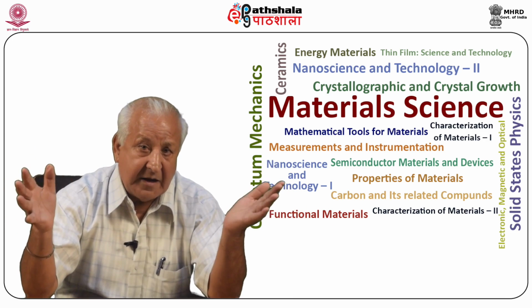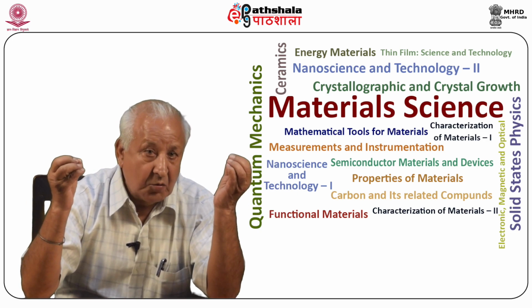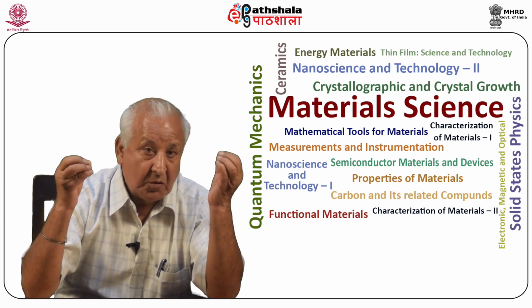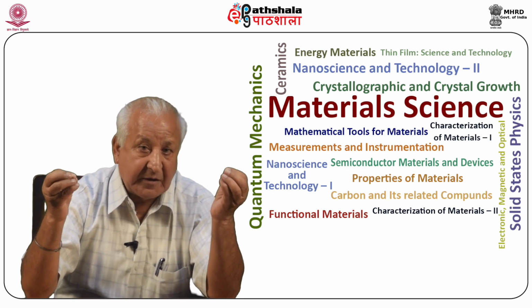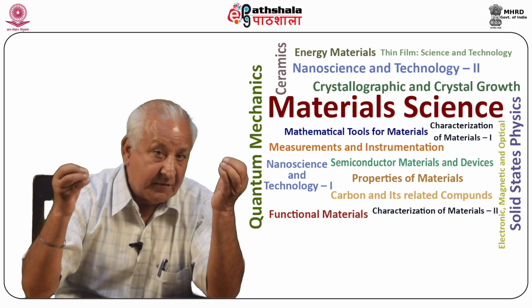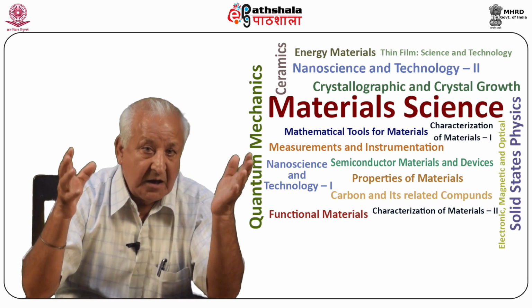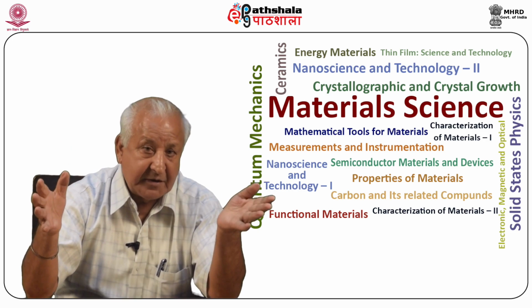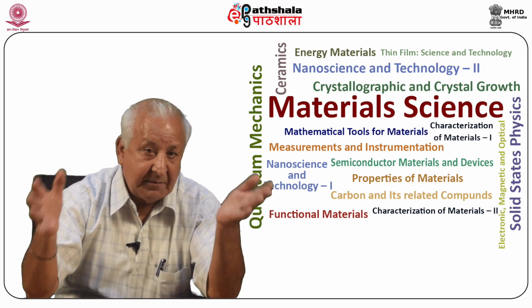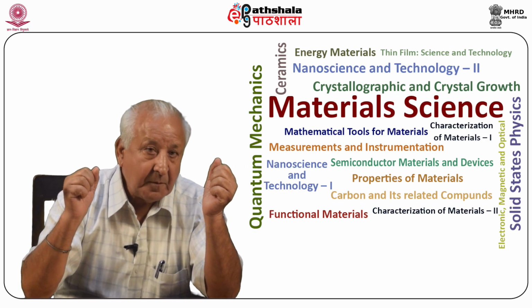From thermodynamic considerations, it is known that crystals grown at low temperatures are expected to have a lower equilibrium concentration of defects than those grown at elevated temperatures. Gel growth being a low temperature solution growth, it finds application in the growth of crystals with fewer defects.